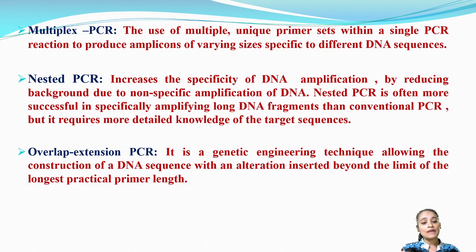Now, what is overlap extension PCR? It is a genetic engineering technique which allows the construction of a DNA sequence with an alteration which is inserted beyond the limit of the longest practical primer length.